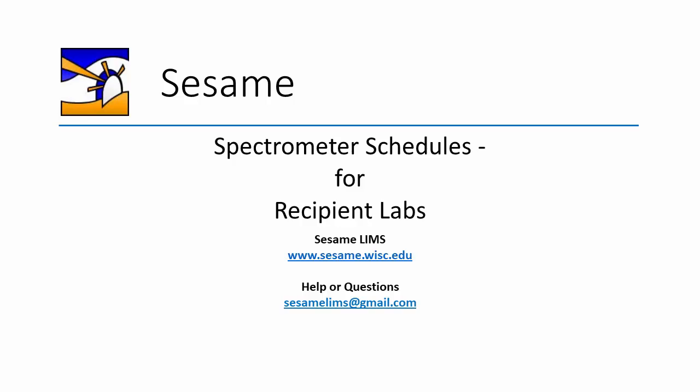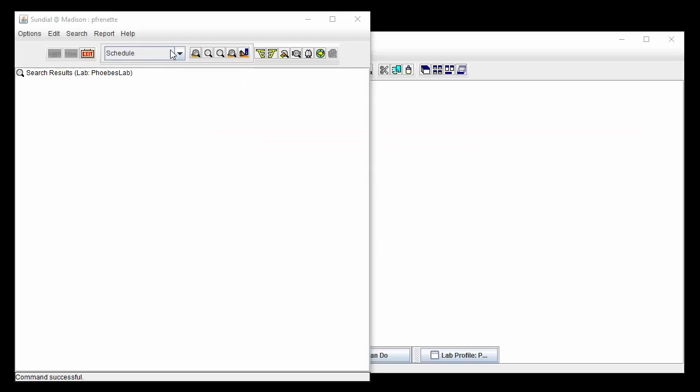Hello and welcome to this video tutorial about scheduling time on spectrometers in Sesame. This video is for lab masters and members of labs that accept time requests and provide the requested resources and services. This is an addition to the video tutorial about scheduling time for spectrometer users. For this tutorial, we will be working in the Sundial module.